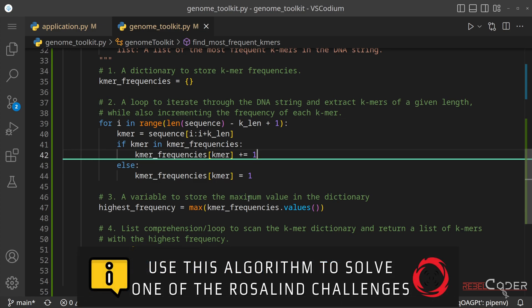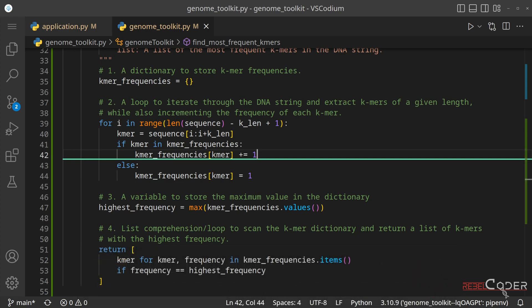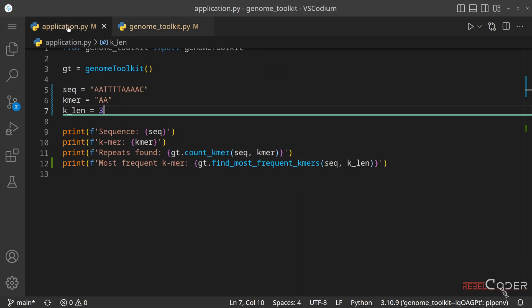We used a dictionary and a simple for loop to solve this algorithm, but there are multiple approaches. One alternative is using the Counter class from Python's collections module. I'll leave that to you to experiment with — and if you want to see an example solved with counters, it will be included in the article version of this video.